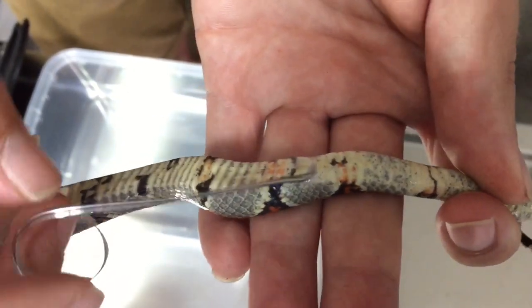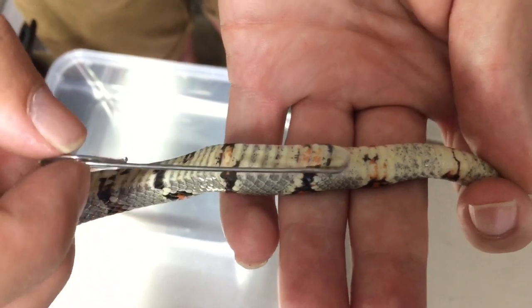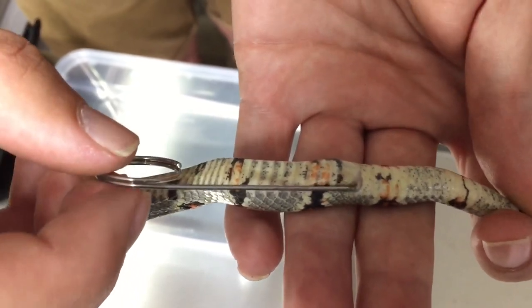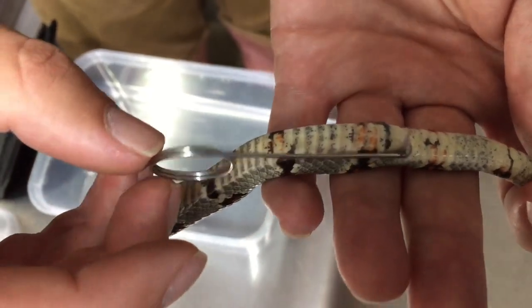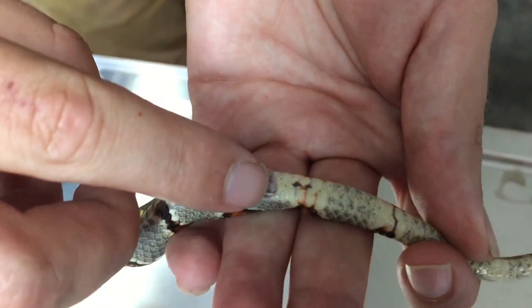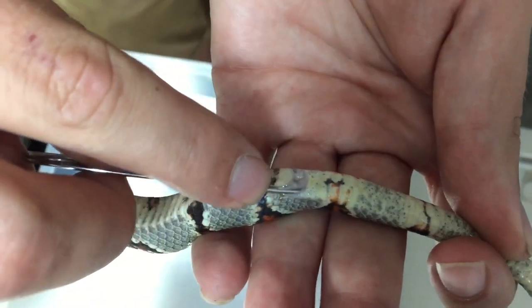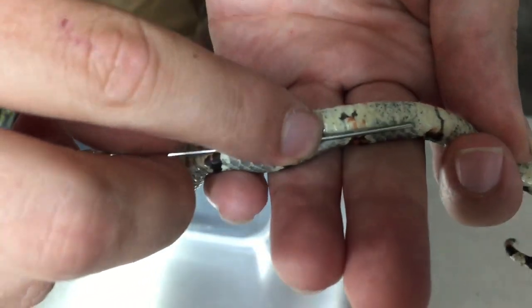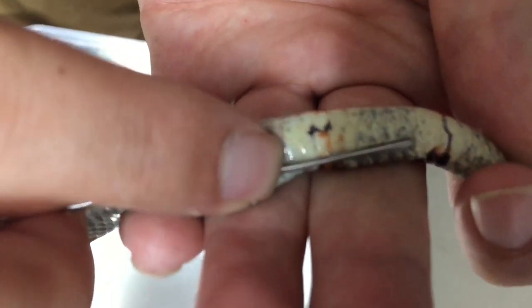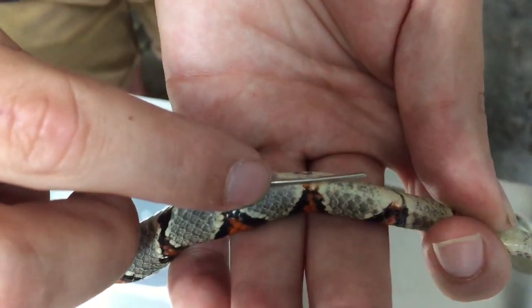We just bend it slightly and gently twist and push the probe softly — it does no harm to the snake whatsoever. This one is going very deep. As soon as it stops I put my finger to mark the point, then slowly pull it out. That's going through about 10 subcaudal scales, so that's definitely a male.